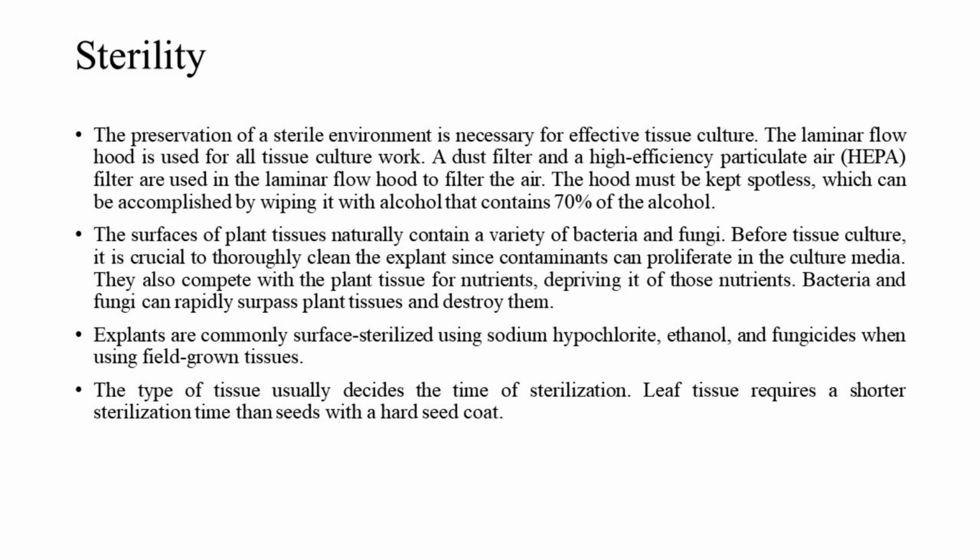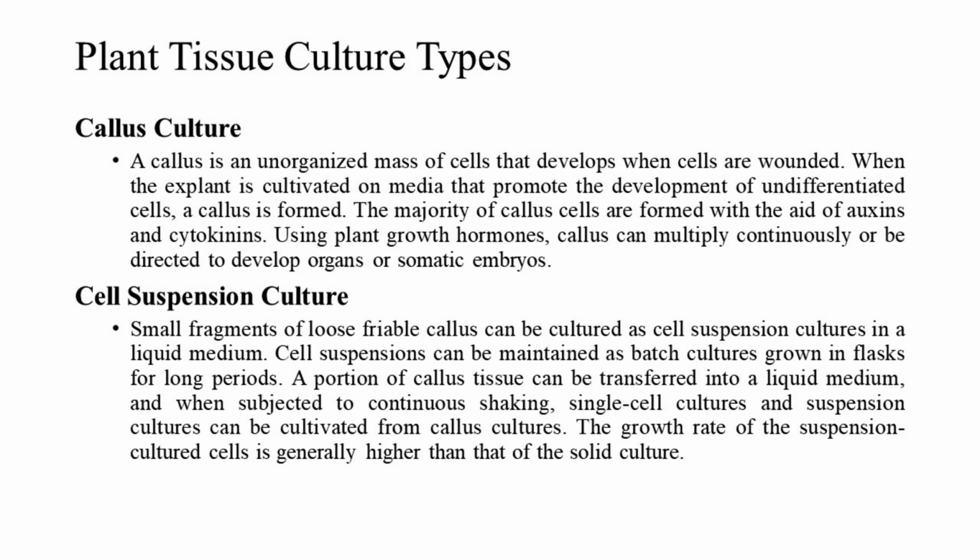Explants are commonly surface sterilized using sodium hypochlorite, ethanol, and fungicides when using field-grown tissues. The type of tissue usually decides the time of sterilization. Leaf tissue requires a shorter sterilization time than seeds with a hard seed coat. Plant tissue culture types. Callus culture.